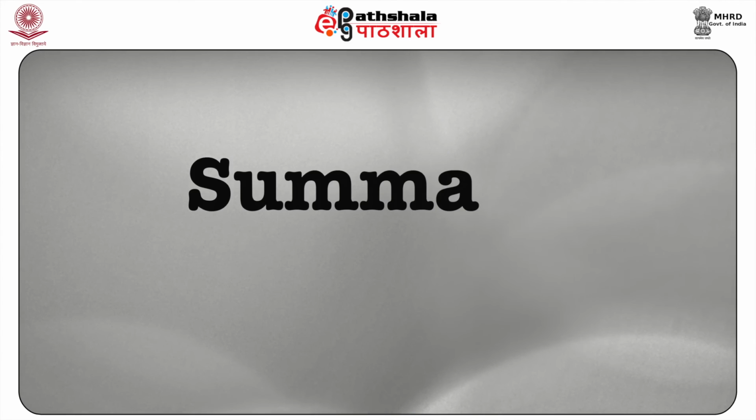Now, after having studied gel filtration chromatography in detail, including all the factors which affect it and the various gels available in the market these days, and how chemistry has progressed in achieving so many gel-based materials, different in structure and for each type of use which a chemist desires, I would like to summarize this module. In this module, we have taught you that chromatography is based on the fact that different compounds can distribute themselves to varying extents between different phases and separable portions of matter.